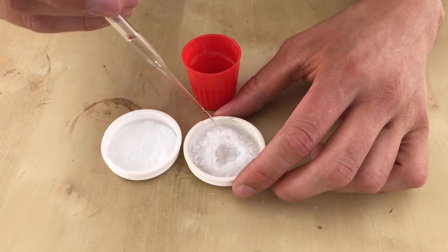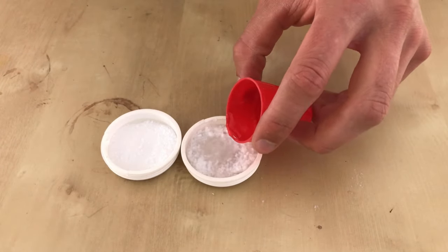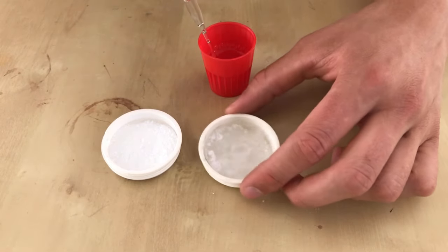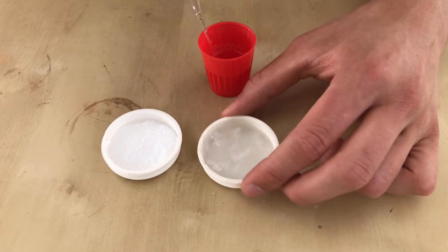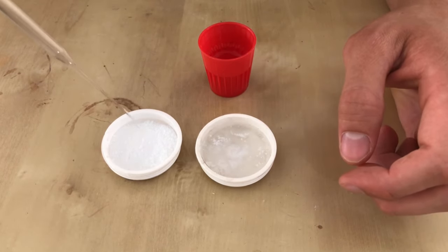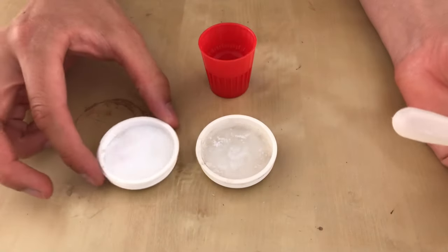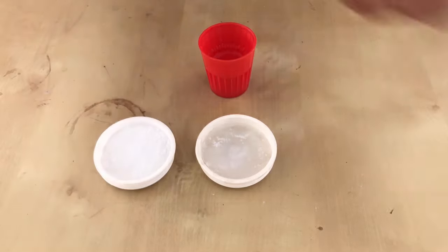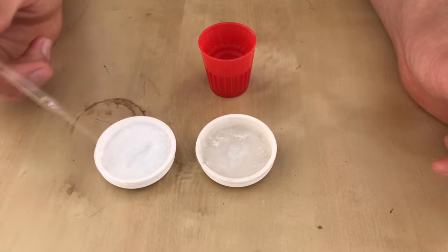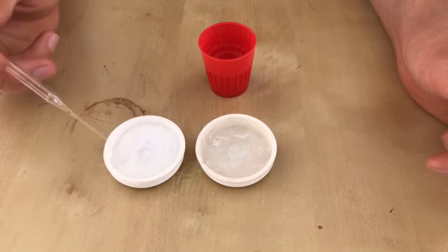hydrophilic, it sucks up the water. Now let me quickly add some more water to it. And you can see that all of it becomes wet. Literally all of it. More water to the hydrophobic one. And even if we swirl it around, it looks like it stays dry. Let me give it a stir with the pipette. The hydrophobic one definitely stays dry.